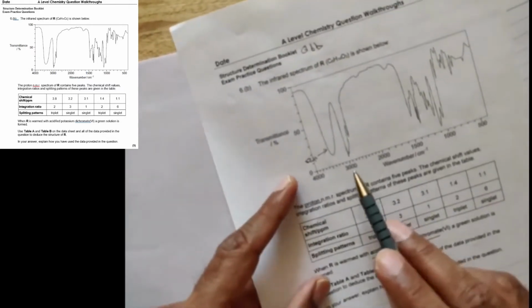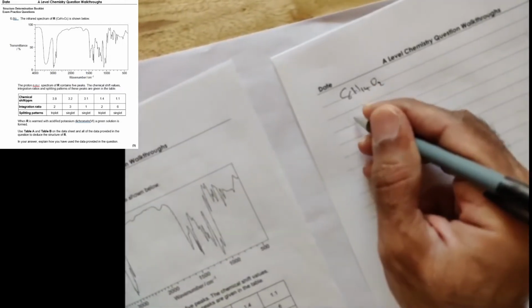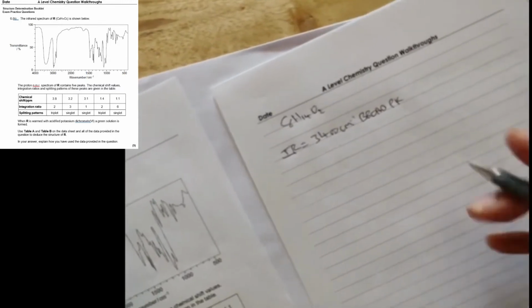Now when you read this, you've got to be fairly accurate with the wavenumbers. So that's 1, 2, 3, 4, 5. That's 3,500 there, so that's 3,400. So the peak is at 3,400. I'm going to put that down: IR equals 3,400 per centimeter, and that is a broad peak. And that must be due to an alcohol.